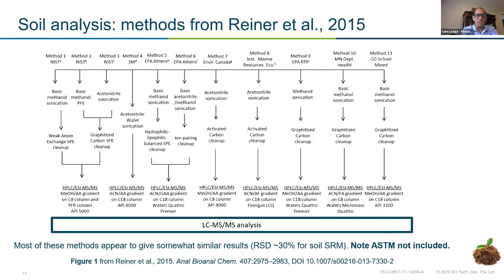One important consideration here is very few of them actually use solid phase extraction. Most of them are just using either a dilution after a methanol shake, or they use a carbon cleanup to remove organic interferences, which can cause suppression of your PFOS primarily. You'll see that there's been some evolution of these methods as we move on.